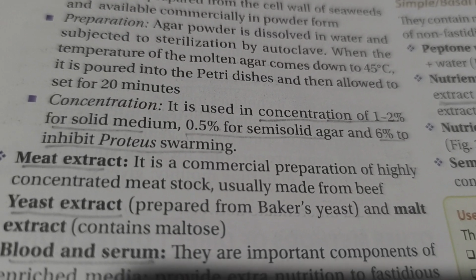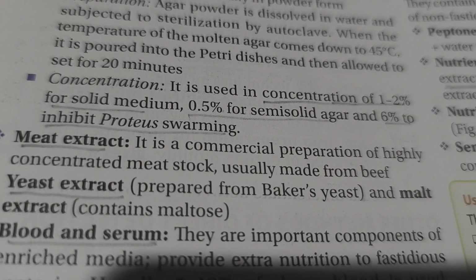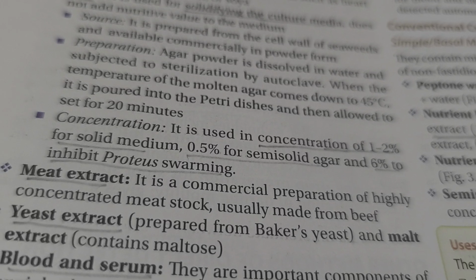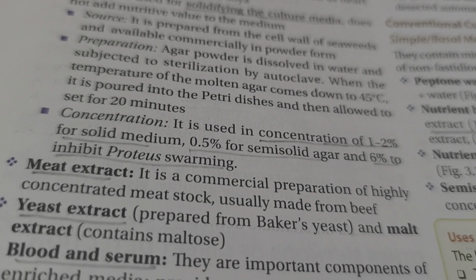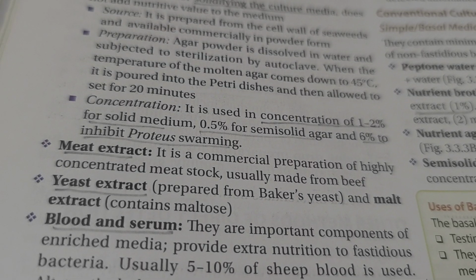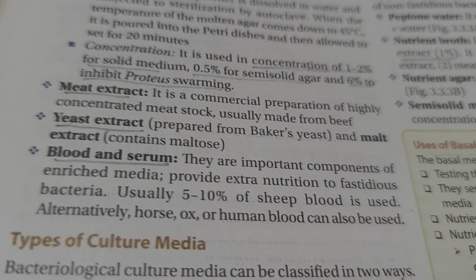Preparation. Agar powder is dissolved in water. When the temperature of the molten agar comes down to 45 degrees Celsius, it is poured into the petri dish and allowed to set for 20 minutes. Concentration.